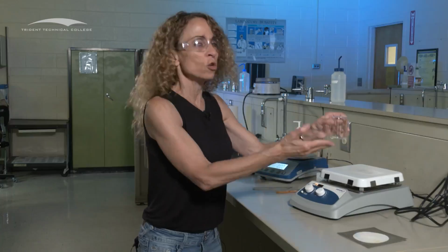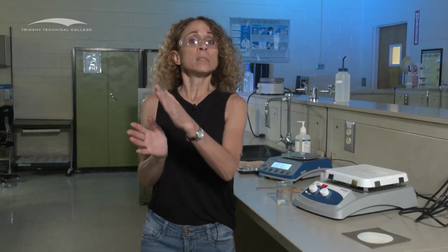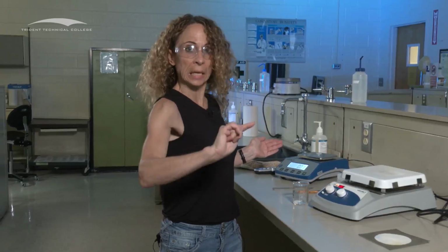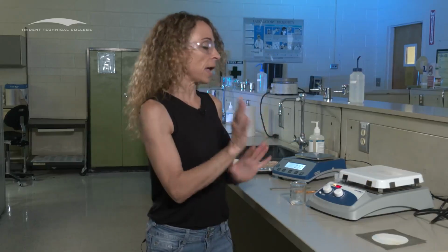You're going to heat, you're going to cool, you're going to weigh. All right, and now take that weight from the second heating, okay? Because the bottom line is that you want 2 consecutive weights where the difference is less than 0.01, okay? So you're going to keep repeating this cycle until you achieve that, okay? And now I'm finished.